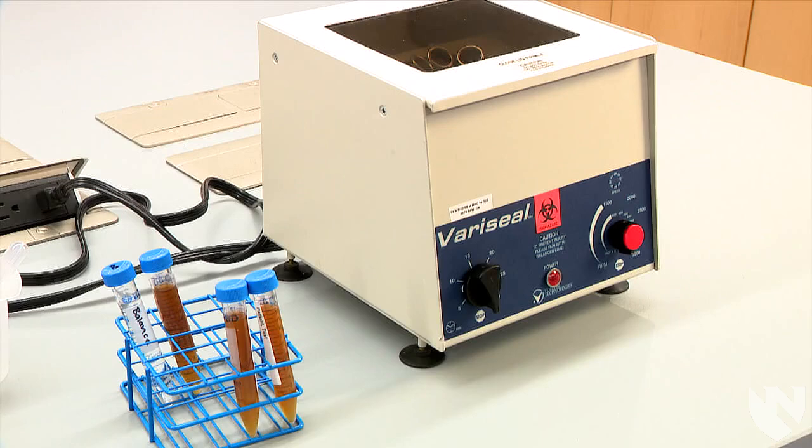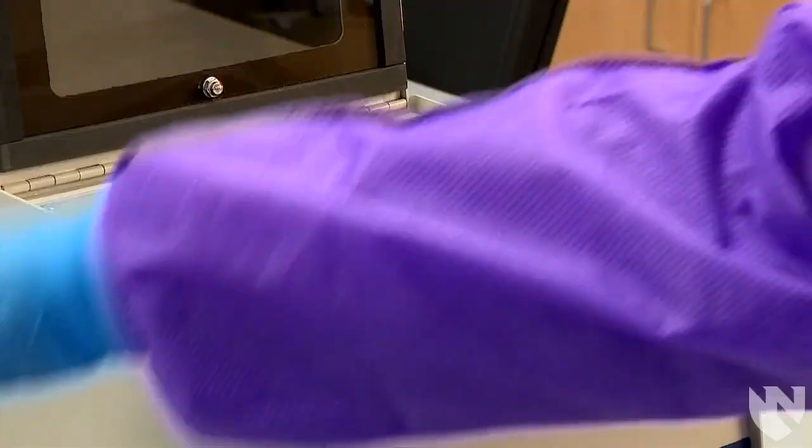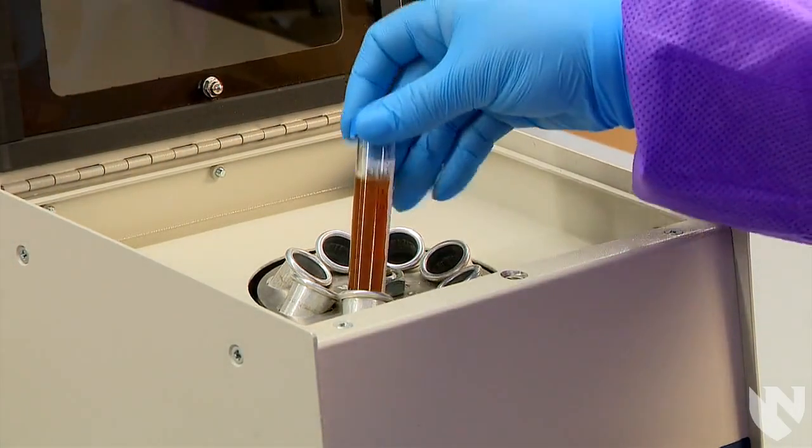The urine is centrifuged after a reagent strip has been dipped in the unspun urine and the lid is placed on the conical tube. Open the lid of the centrifuge and place the conical tube containing the 10 to 15 milliliters of urine in the centrifuge.